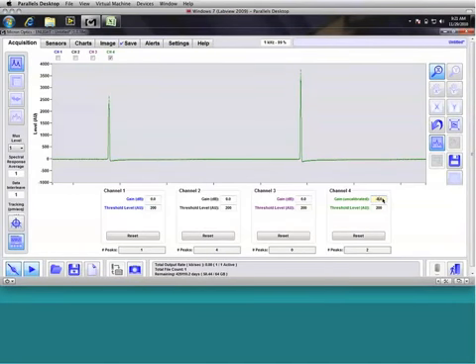During calibration, all of the instruments are calibrated from a negative gain of -5 up to a positive gain of 20. And so if a negative gain beyond -5 is required, ENLIGHT will still facilitate that, but the exact translation of how many dB per adjustment is uncalibrated below -5. However, it's really more just for the ability to track that with dB. It doesn't affect the performance of the instrument or of ENLIGHT in any way.